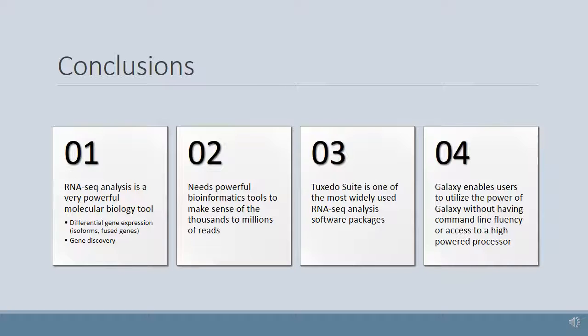One thing that's really nice with the Galaxy is it allows for people who are non-computationally minded to run through these workflows, because there are many out there that exist, without having to know a whole lot about computers. The Galaxy provides a really nice interface for these biologists to go in and perform their own analyses.